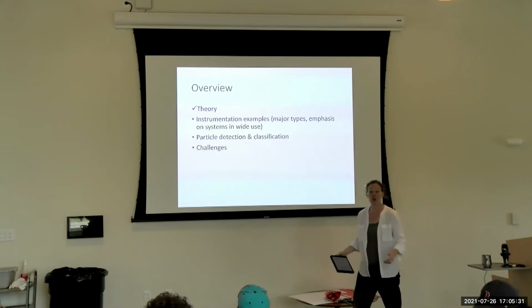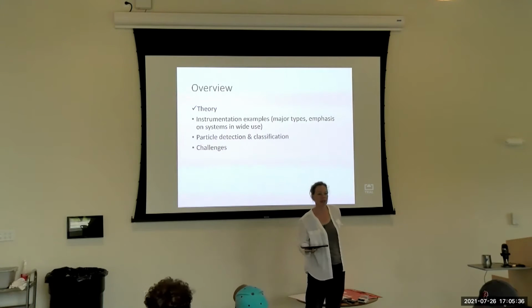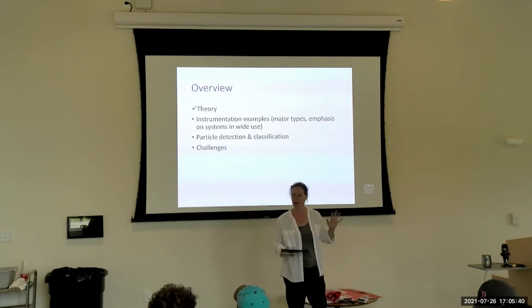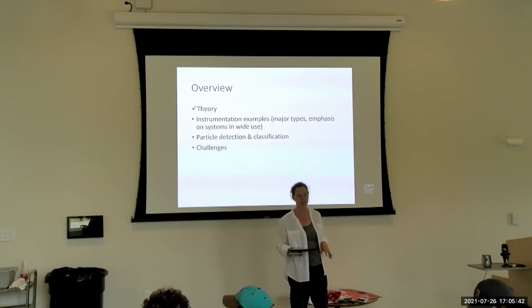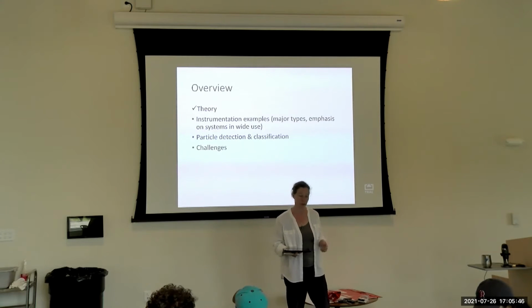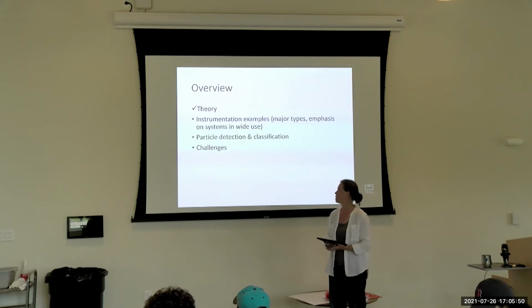All right. So where we left off, we just talked through imaging systems that are used traditionally, like microscopes, and some of the in situ imaging systems, and their commonalities, what limits their resolution, right? Their system resolution, their optical resolution, and the digital resolution of the camera.